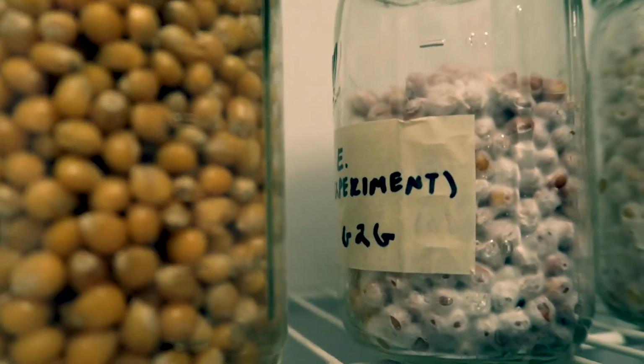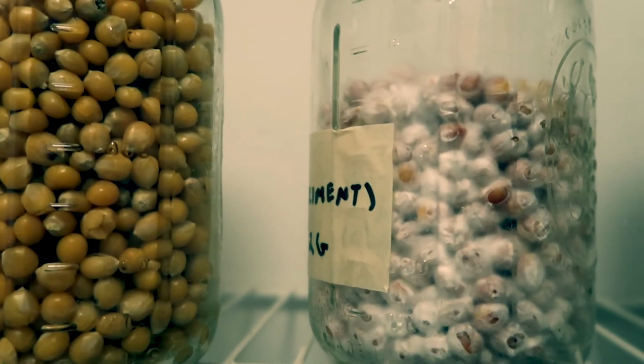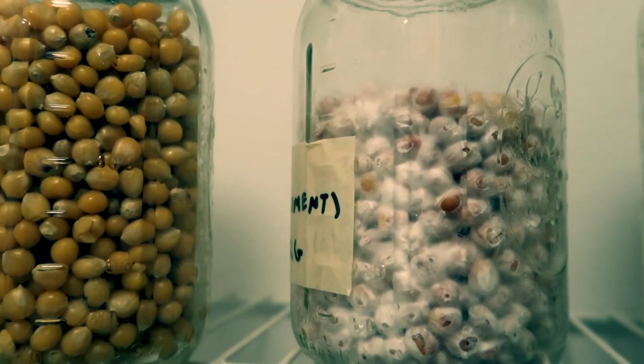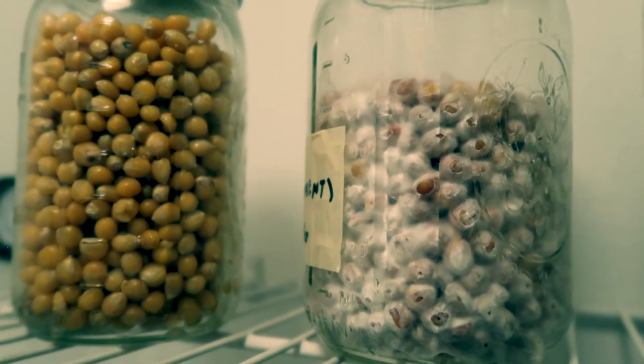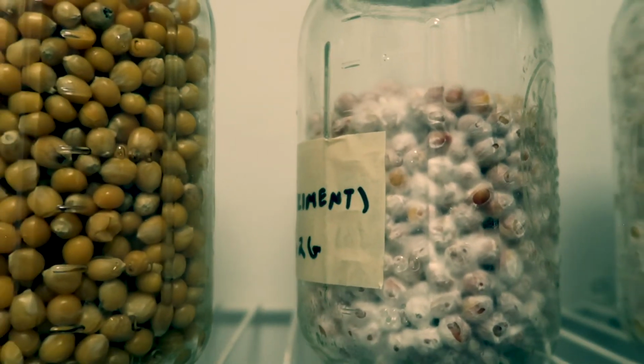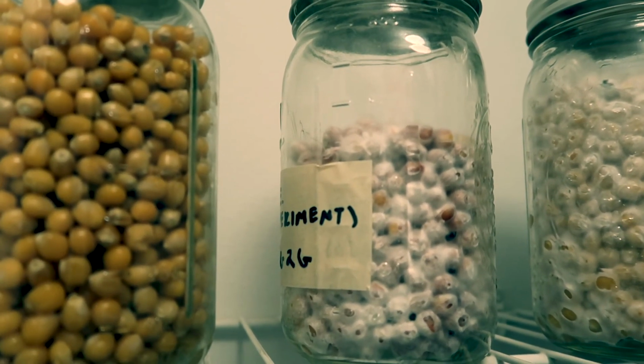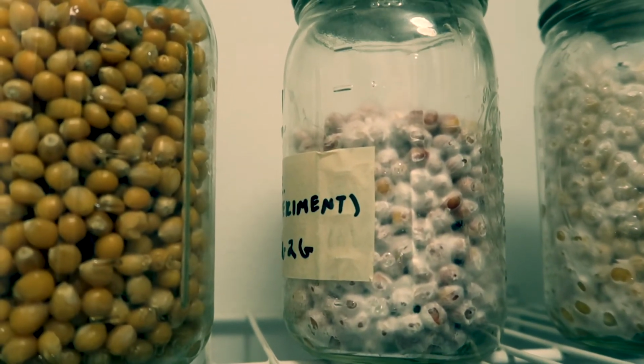So even though this grain-to-grain transfer right here was just inoculated with other colonized popcorn, I could have taken some 90-second microwavable brown rice that was fully colonized and use that as a grain-to-grain transfer to inoculate this jar. Mixing and matching your grains for a grain-to-grain transfer is no issue at all, because it all comes down to the mycelium that you're putting inside of the uncolonized grains.